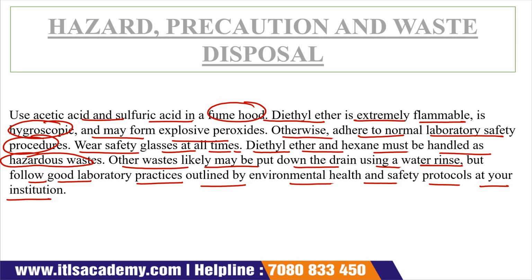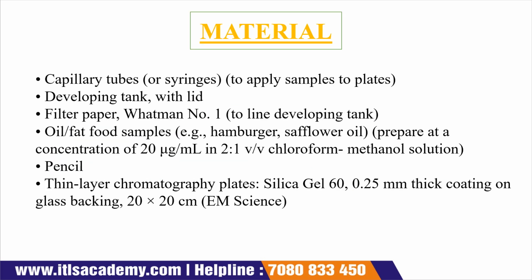Okay, so the next one is the materials used in this experiment. The first material that we require is a capillary tube or syringe, and this is required so that we can apply the sample onto a plate.